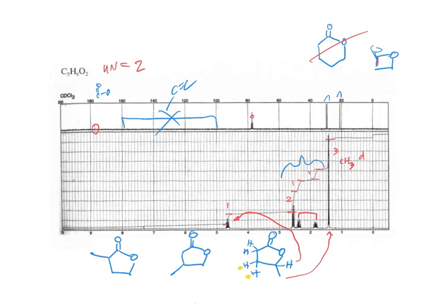So this yellow and yellow is going to be here and here. And then it just turns out that these other two are probably different, but they're almost the same, and we can't really see how complicated that peak is. And then the wide doublet is from the geminal coupling, correct? The wide doublet? Well, the reason they're so spread out is because of the geminal coupling. No. The reason they're so spread out is because those two protons have very different chemical shifts. What I've written in red there is just a chemical shift difference, not a coupling. The geminal should be the biggest coupling, but it would be down in there. We just can't see it well enough because it's too small. Okay.